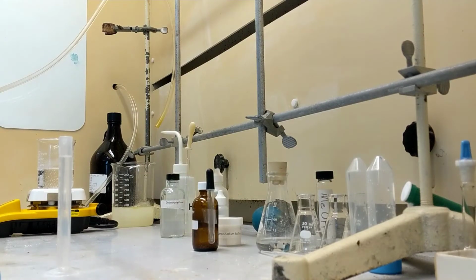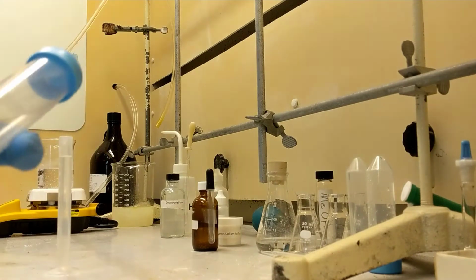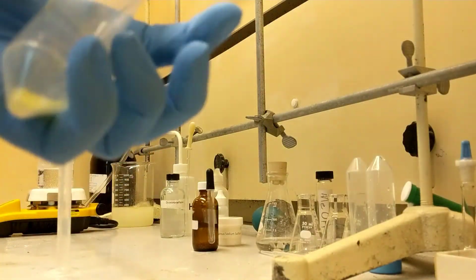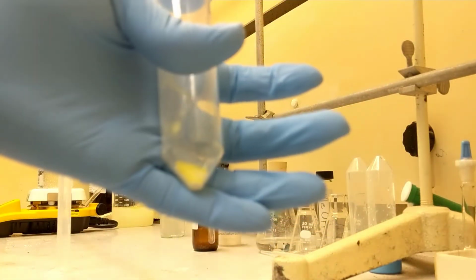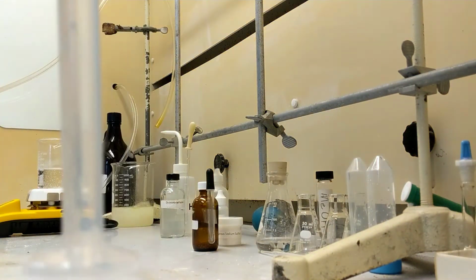Alright guys, this is our last experiment, experiment 3D. I put in here about 0.36 grams of unknown A. And to it, I'm going to add 10 milliliters of diethyl ether to dissolve.